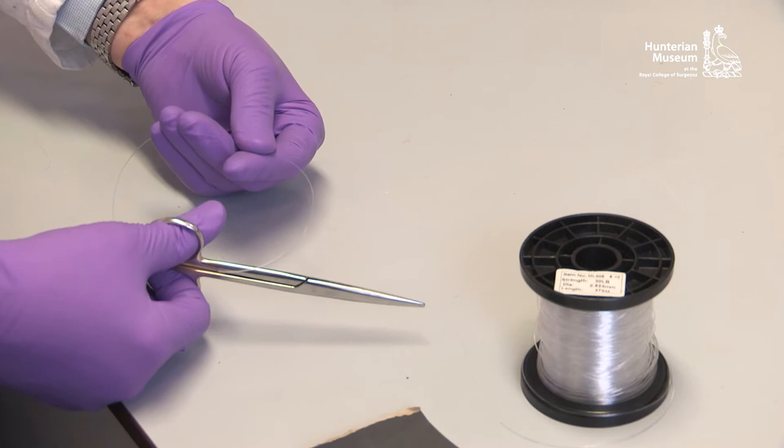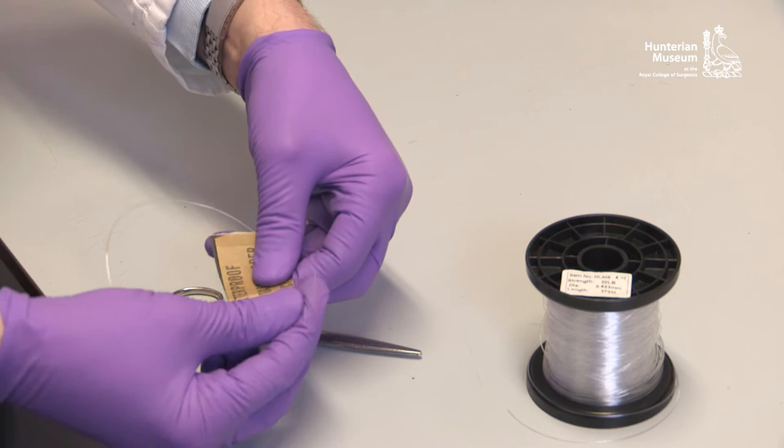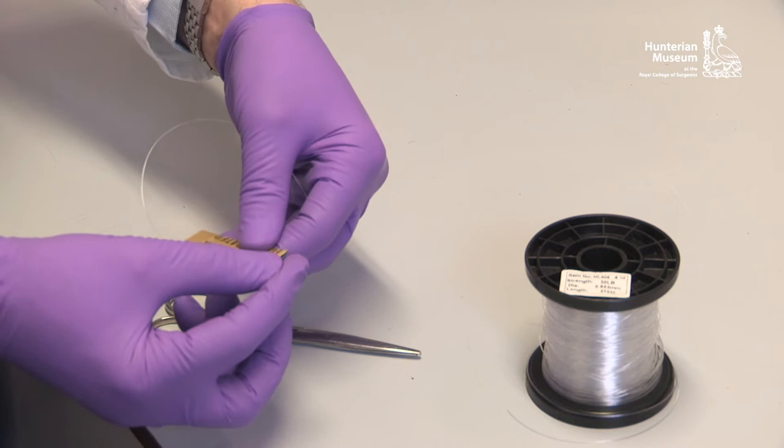Small glass beads or short lengths of nylon monofilament can be used to retain the thread in place. It is beneficial to roughen the shiny and slippery surface of the nylon monofilament by gently rubbing a fine-grade wet and dry paper along its length. This prevents slippage of the thread.